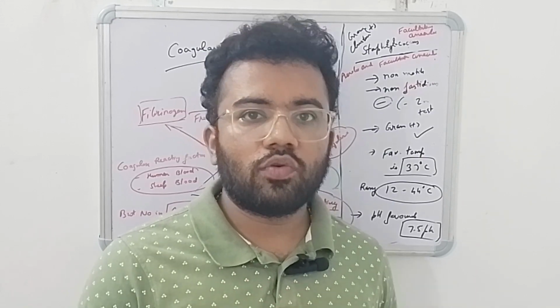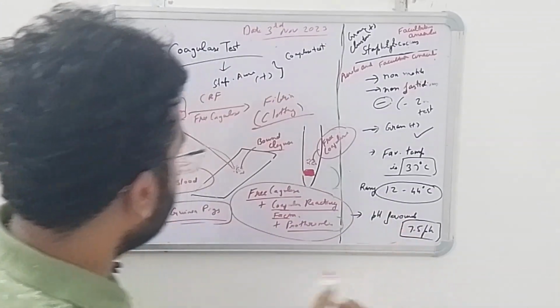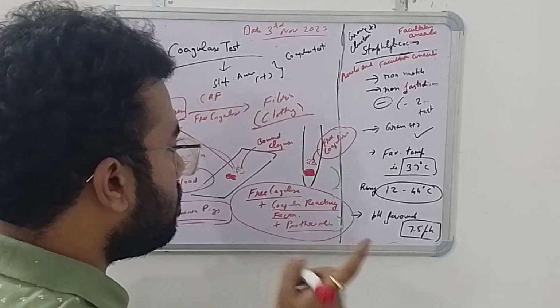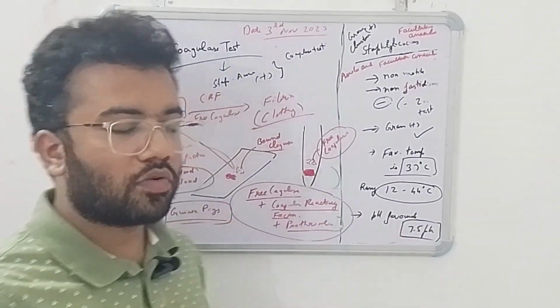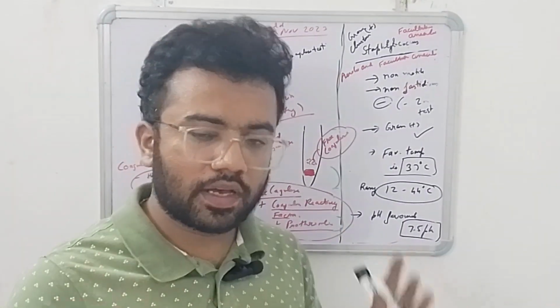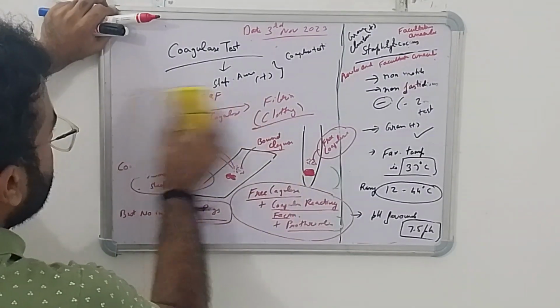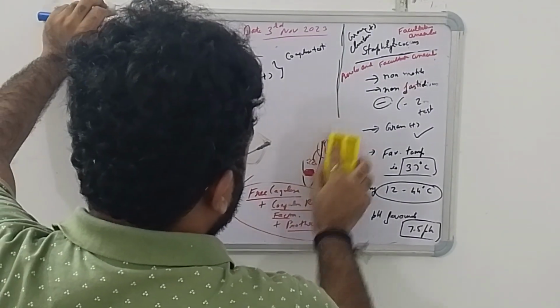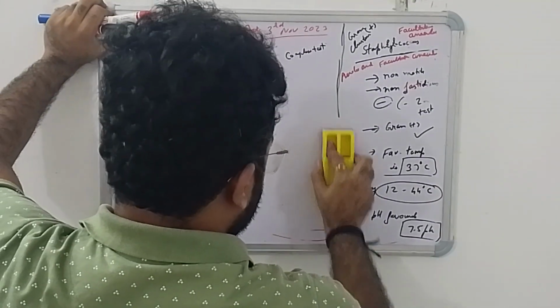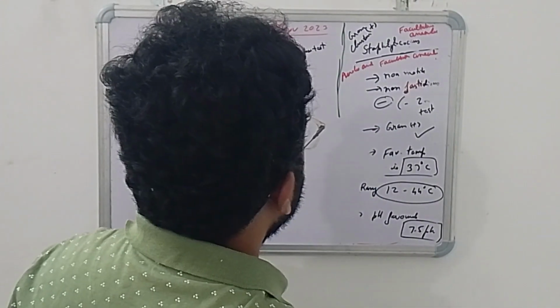Bound coagulase will directly work on fibrinogen conversion into fibrin, so you will see clotting. So it is also a coagulase test positive, but because of bound coagulase, not free coagulase. Here there will also be clotting, but with the help of CRF. So that's the concept of coagulase. I will drop this, and we have some minor tests left now. So catalase done, coagulase done.